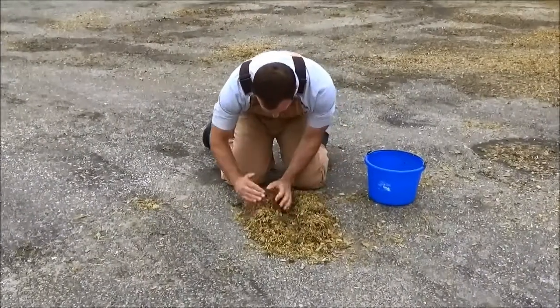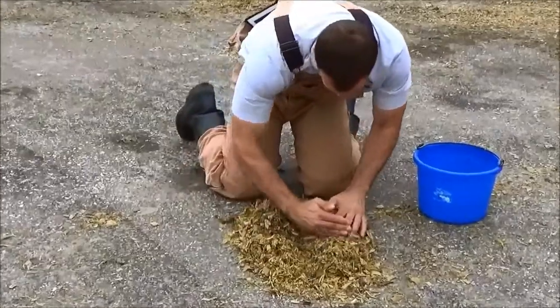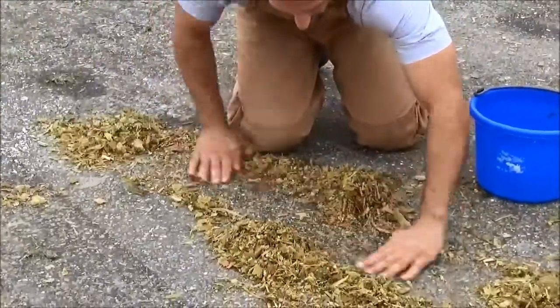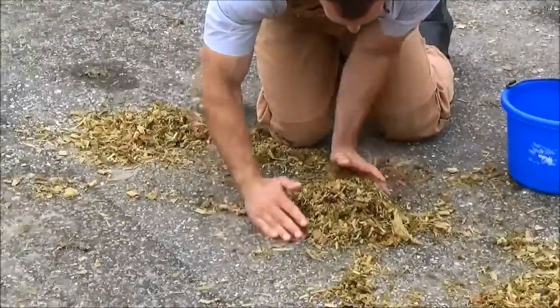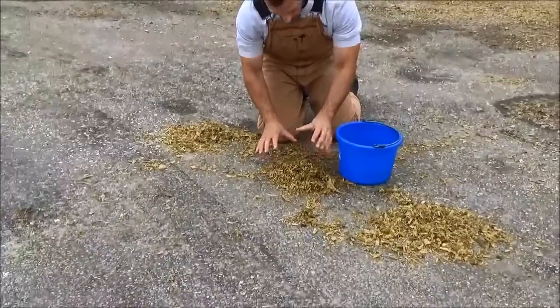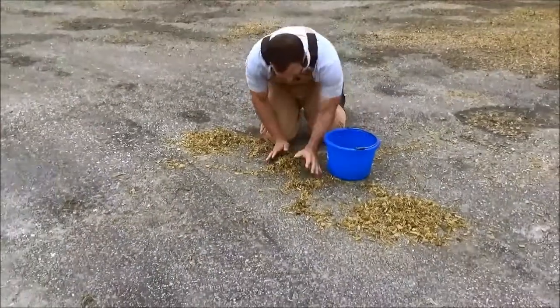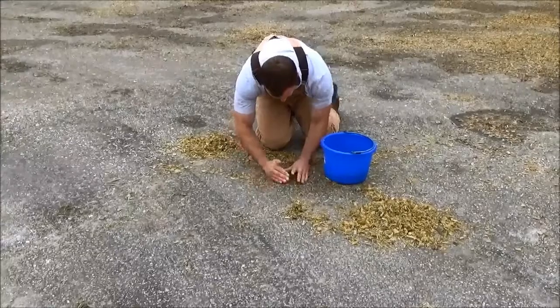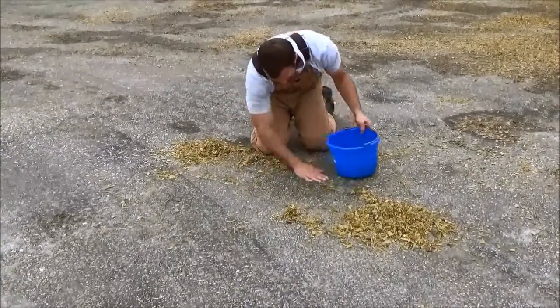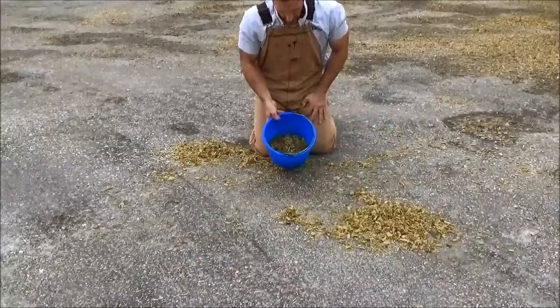Crudely divide the sample into quarters — one, two, three, four. We're going to discard two quarters and bring two back together. This is still too large for my quart-size sample bag — still too much sample to send to a laboratory. Having a flat, clean surface is important so we don't lose any grain or fines.